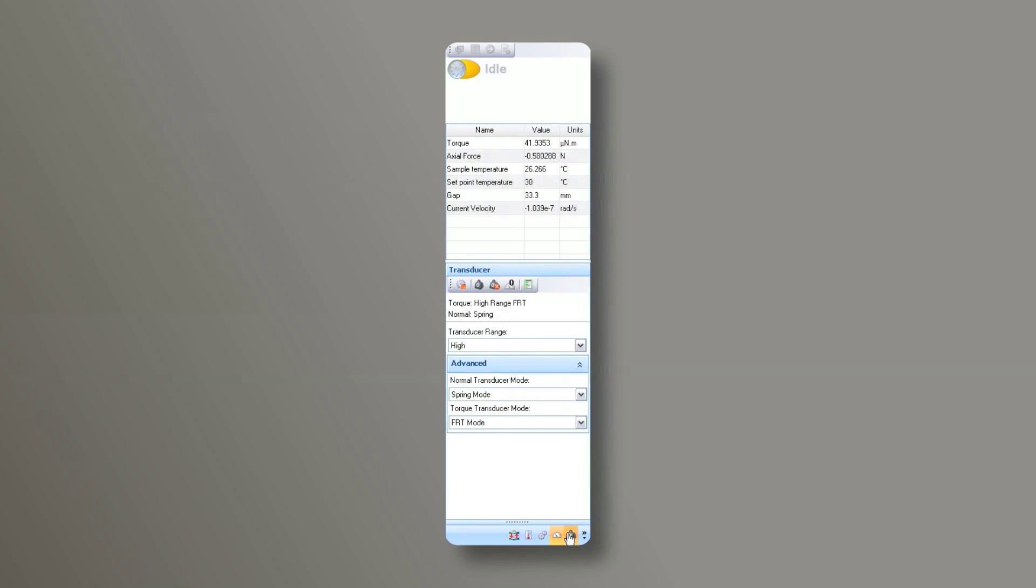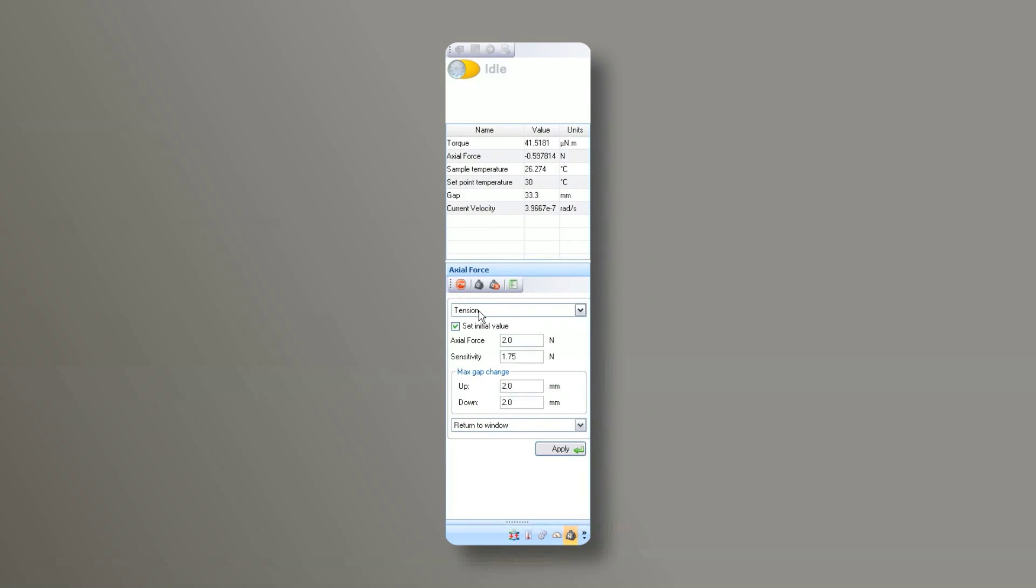Using the control panel, choose axial force control and apply 2 newtons of axial force with a sensitivity window of 1.75 newtons in the tension direction.